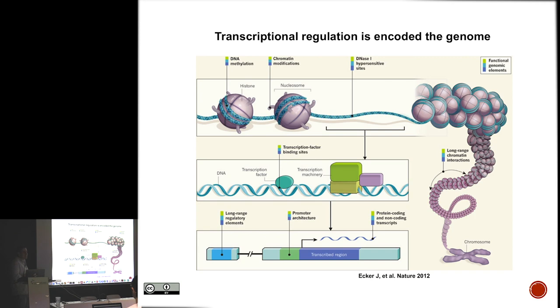Okay? So ATAC-seq and DNase-seq was originally described as DNase 1 hypersensitive sites. I'll talk more about the history of that on the next slide. But in essence, the way you want to think about ATAC-seq and DNase-seq is that you're looking for places in the genome where you don't have these nucleosome structures, or you have this openness, right? So we can call these open chromatin regions. And originally, it was identified that these open chromatin regions actually had some important function. And so early investigation of these open chromatin regions in the genome showed that proteins like transcription factors tend to bind to these specific sites. So these proteins, which have specific DNA recognition sequences, can find these open chromatin regions, bind there, and then we can recognize them. So that was initially how they were being looked at.